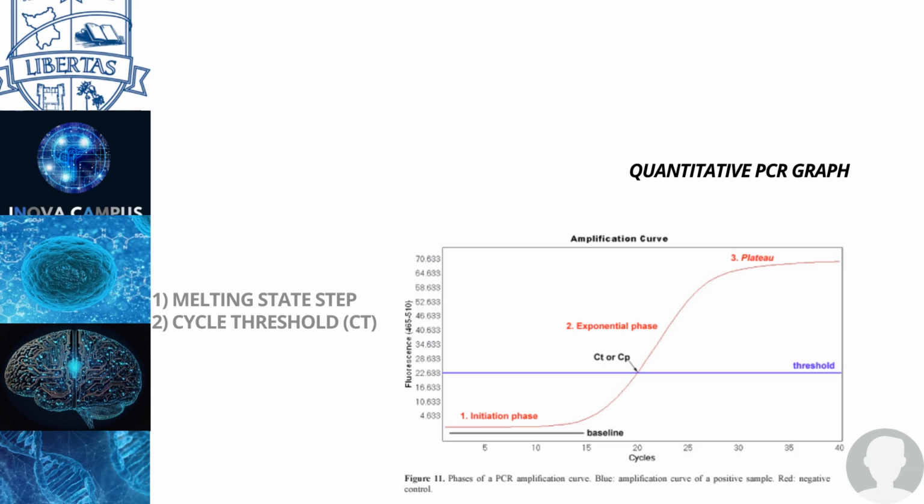And when we're looking at viruses and bacteria, that means that that person is infected with the gene that you're looking for, the gene that you were studying, that you're targeting. All right. You've got to understand that the whole curve shown in the graph shows the fluorescence, as you can read right there, and the number of cycles.